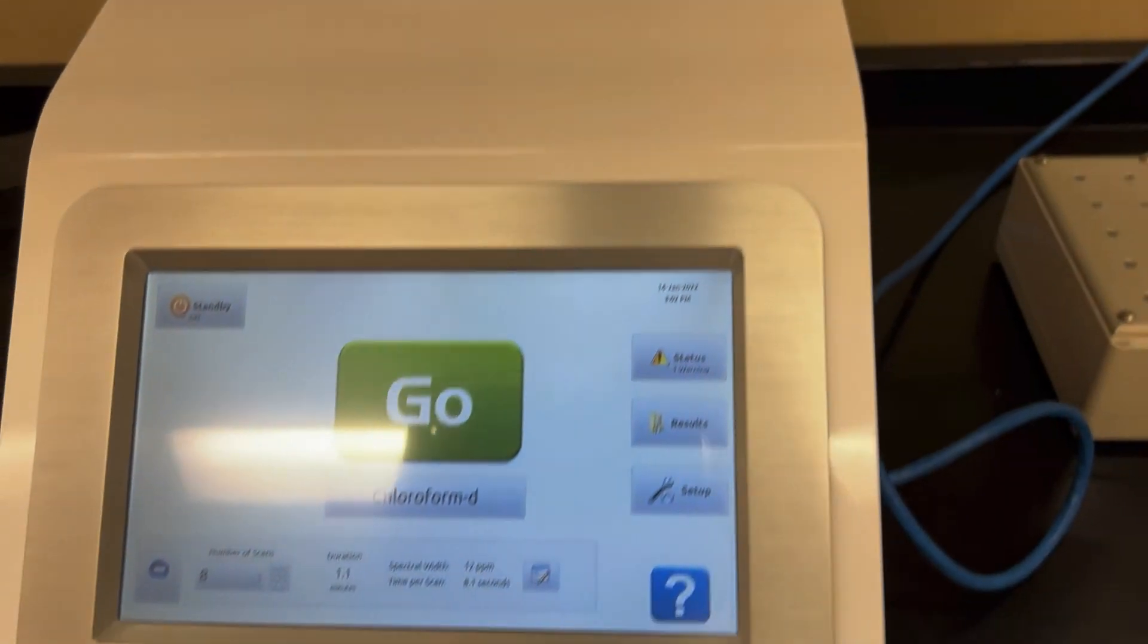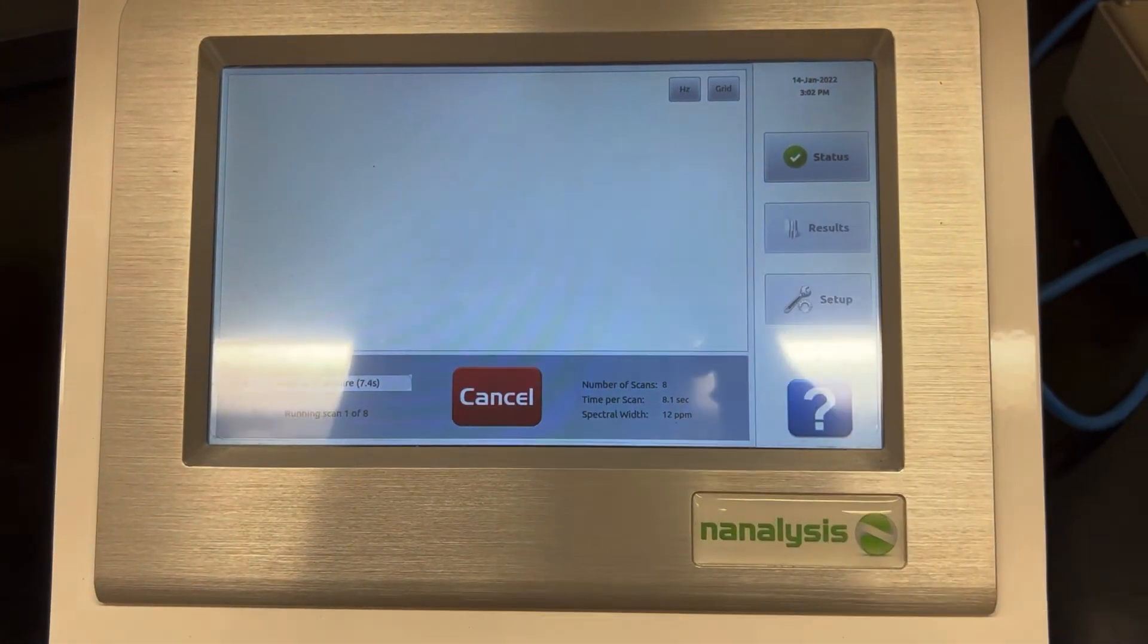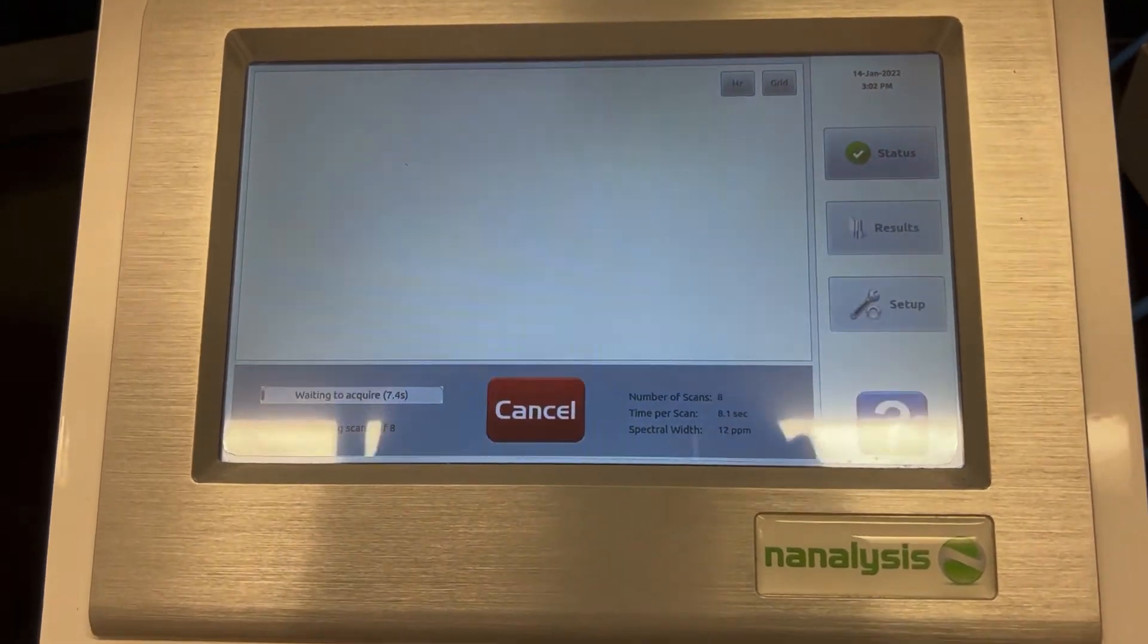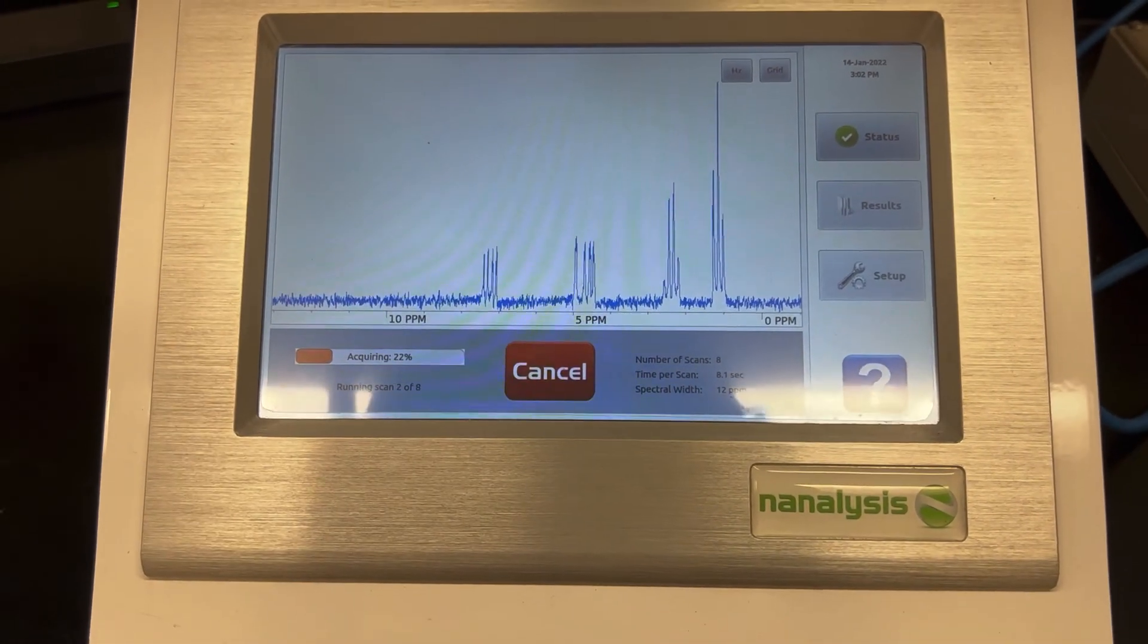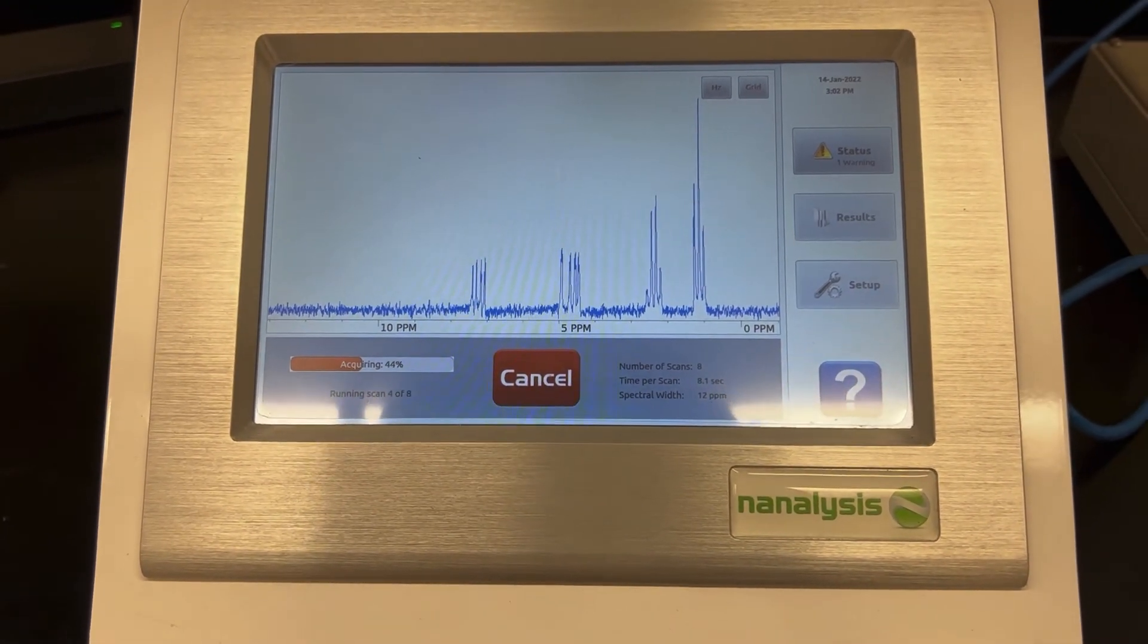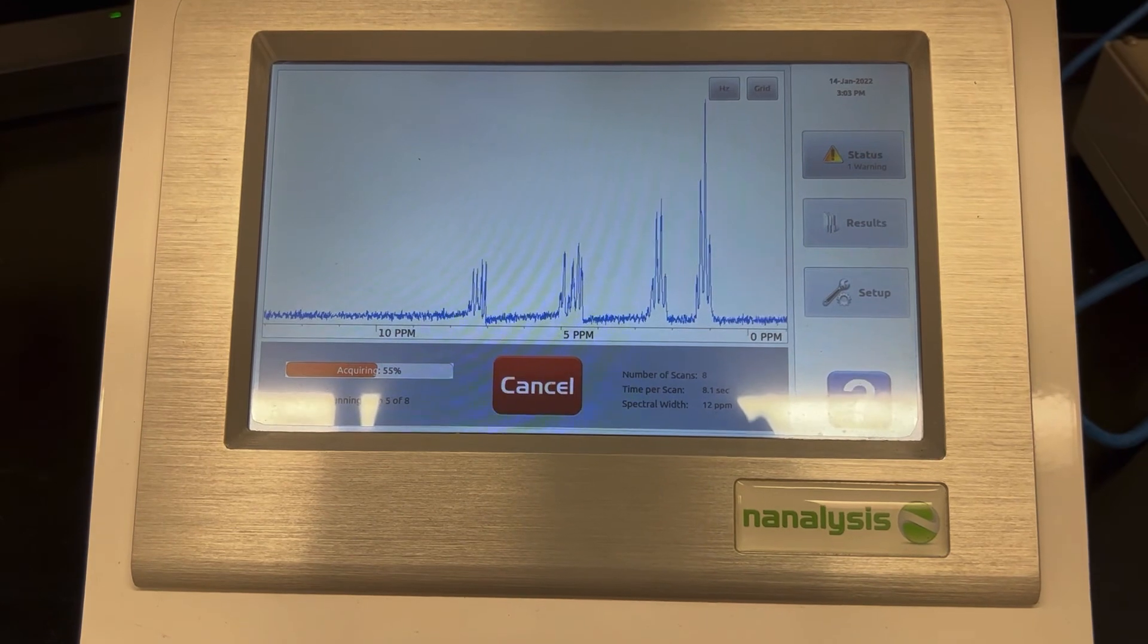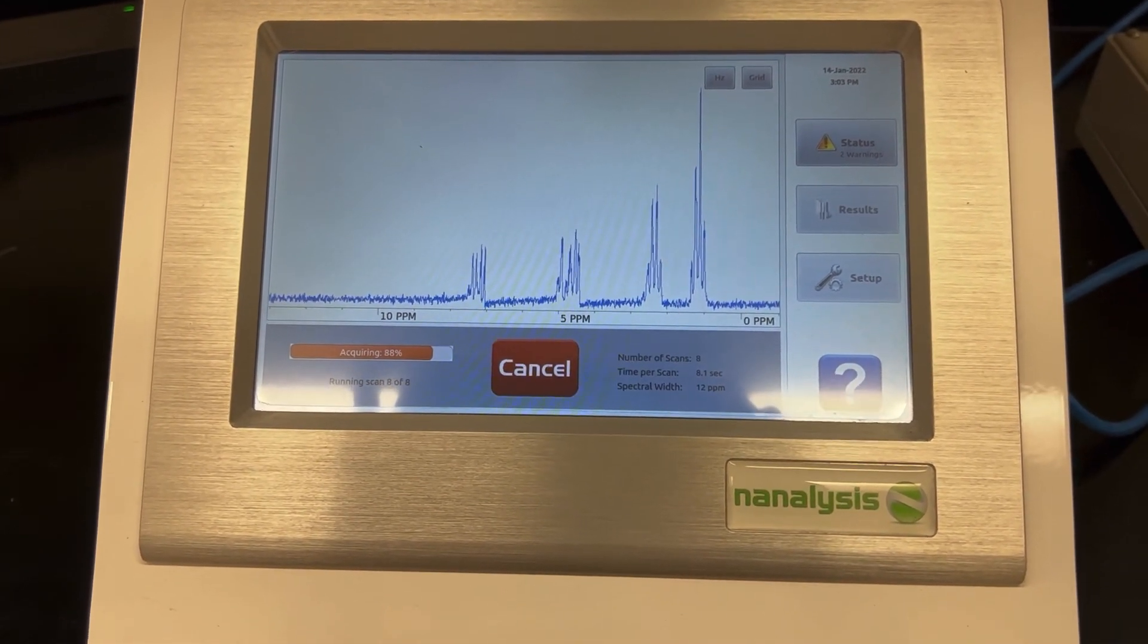And then it's pretty easy. On the touchscreen you're just going to push that big go button. I'm going to make this a little faster for you because it takes a little while, it probably takes about 30 seconds maybe a minute for a normal run, but you're going to have the spectrum show up and it'll keep on getting better and better as more scans happen. You'll know when it's done when that cancel button goes away.